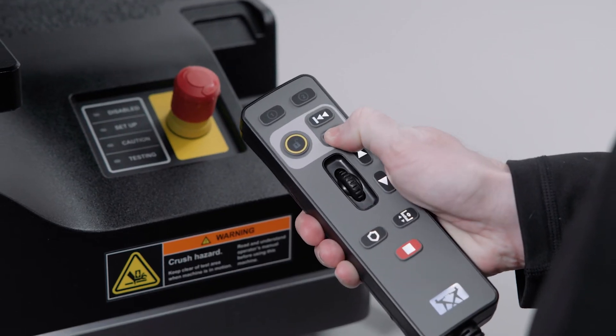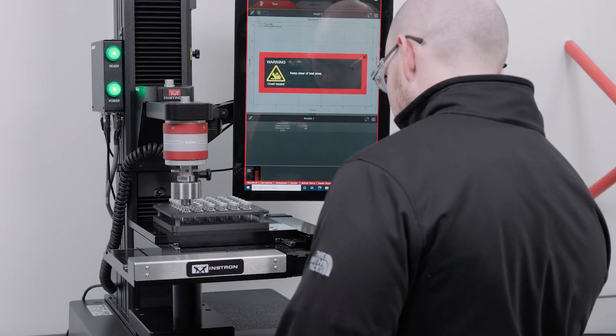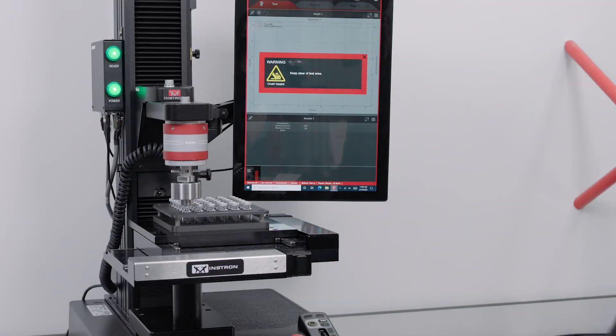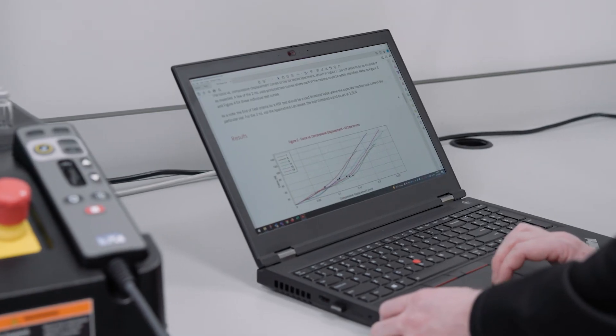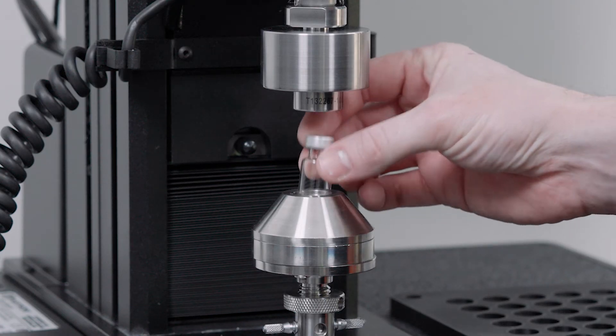After loading the specimens and starting the test, the operator is free to walk away and focus on other important tasks such as preparing the next batch of specimens, working on reports, or performing tests on other machines.